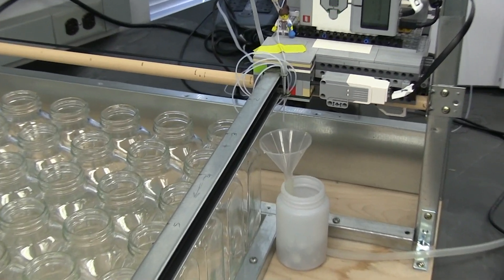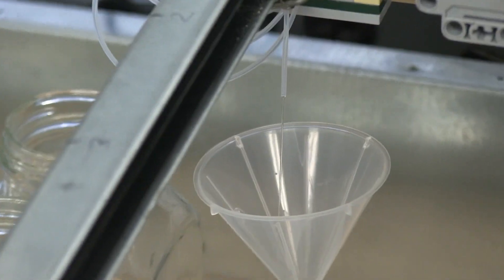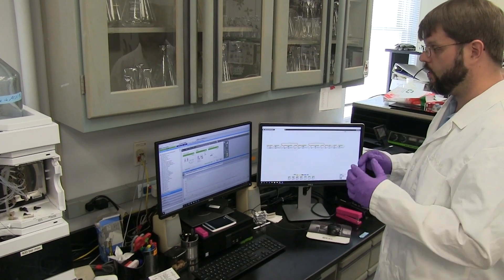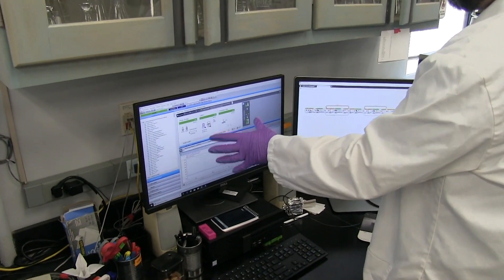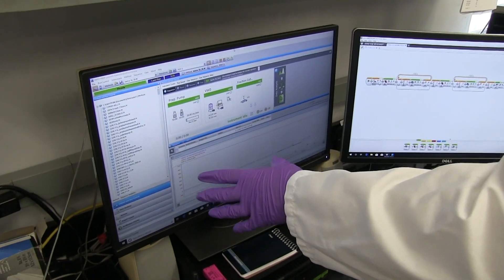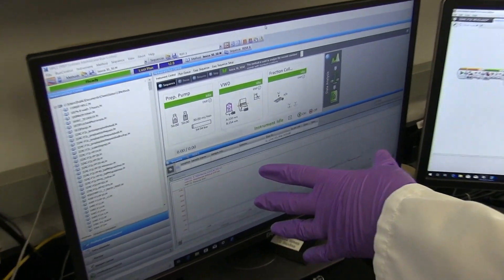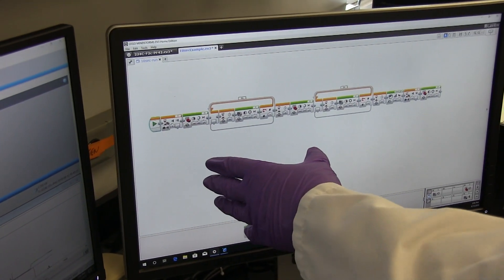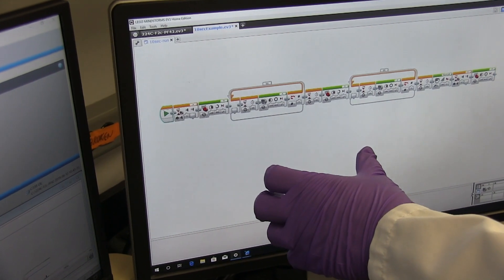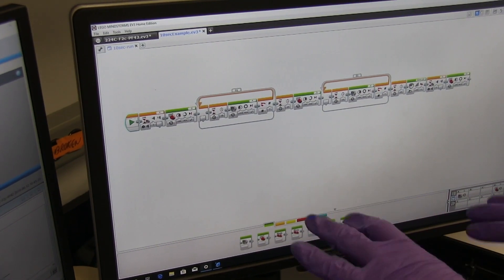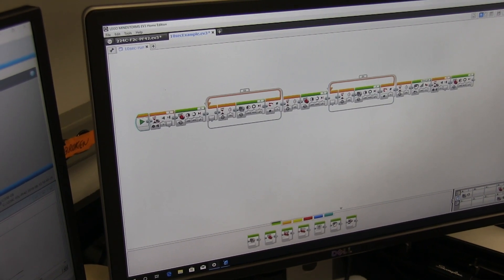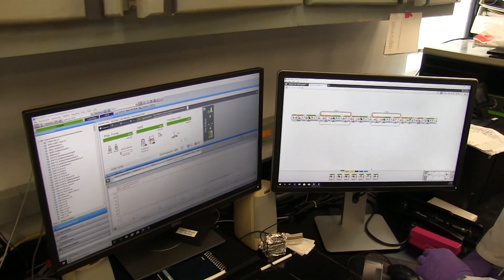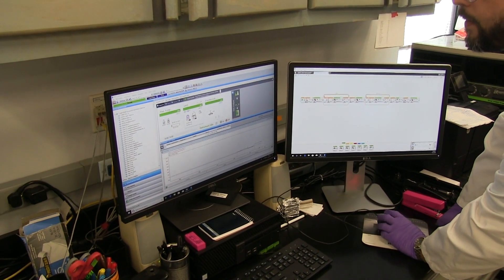The flashing lights indicate that the unit is ready to run. We have a prep HPLC method already developed and loaded on the Agilent Infinity 2 1260 prep scale HPLC. On this screen we already have loaded a fractionation program into the LEGO Mindstorm software. This is a demo program with a 10 second collection into each bottle. Once we have both of the methods loaded into their programs, we start the fraction collector program in the LEGO Mindstorm software.